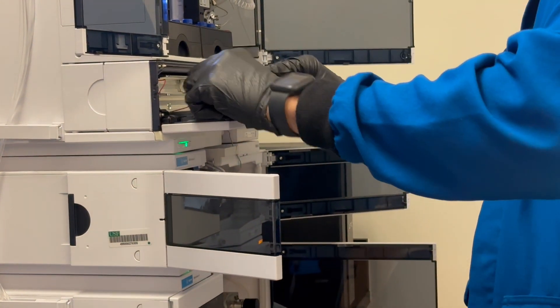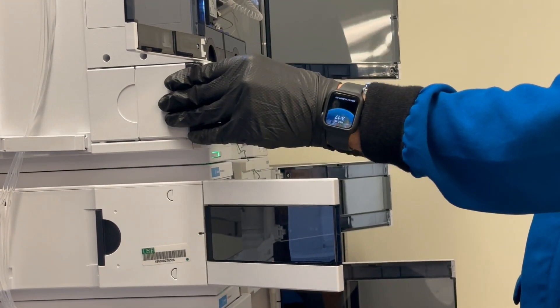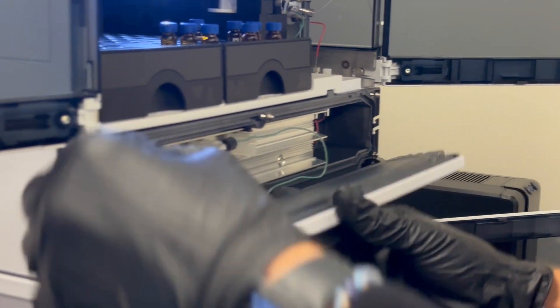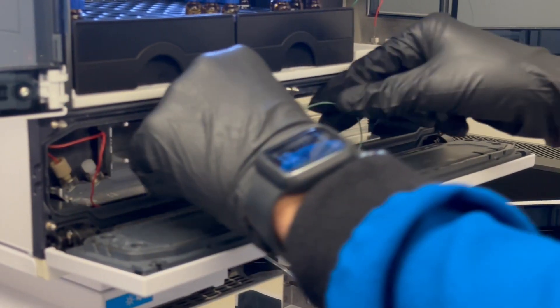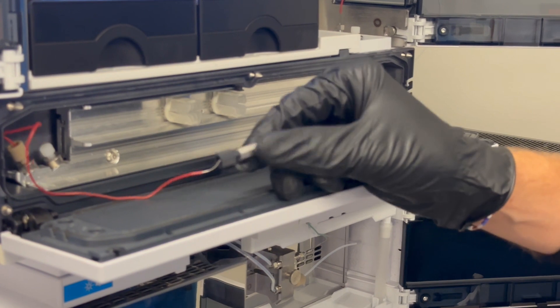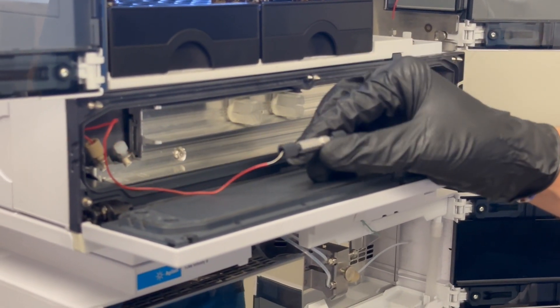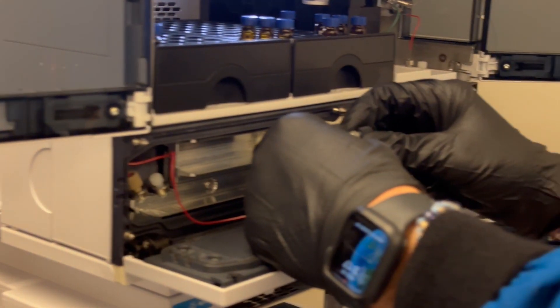Now we can have our column compartment open. If it is not already open, all you have to do is open here and that'll open just fine. So now we have this — this is a faux column insert. This is just a stand-in column; it doesn't actually work as a column and does no separation.